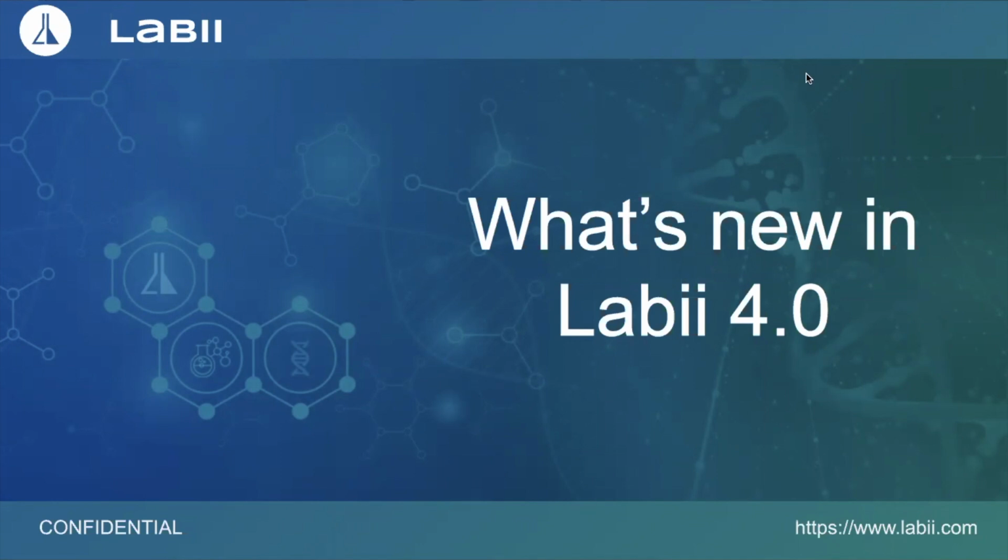Yeah, that sounds good. And just FYI, Yonan, I think we have two people who are newer to Labii. So I know today is more about looking at updates, but just keep that in mind as well. Sure. So I think for those two, I may give some separate trainings just after this meeting. Okay. Yeah. So should I get started? Yes, please go ahead. Okay, so thank you, Jack, for organizing this meeting.